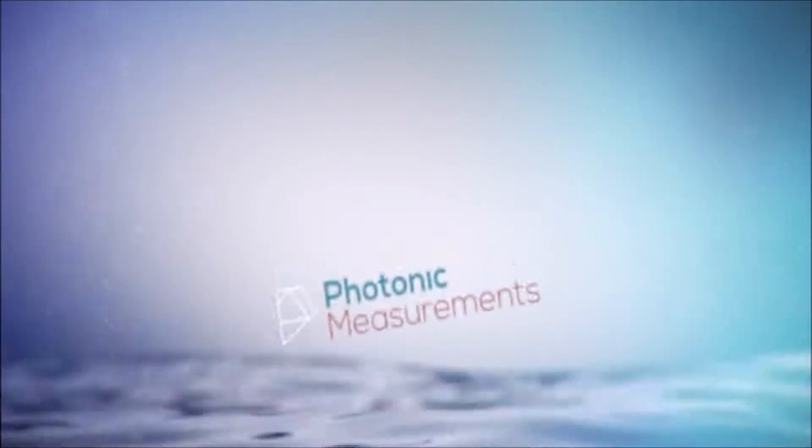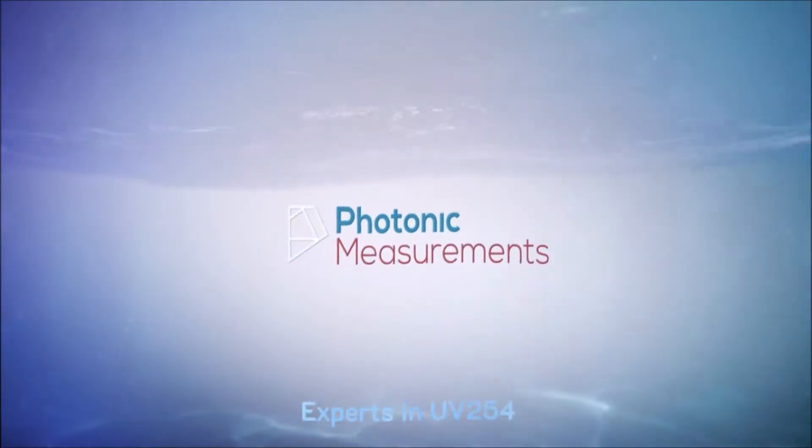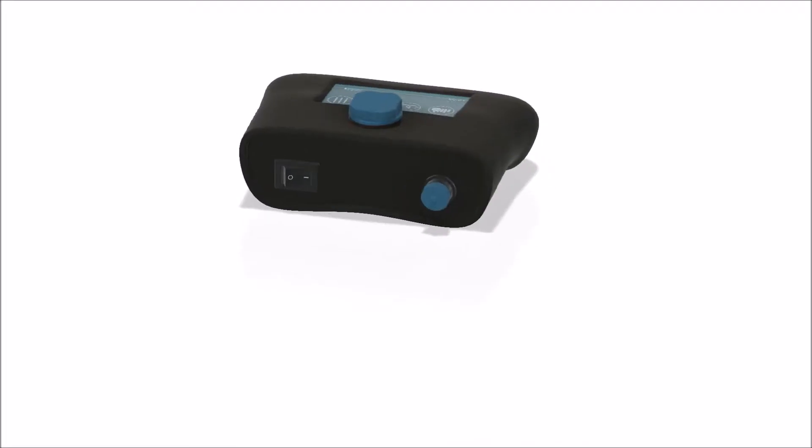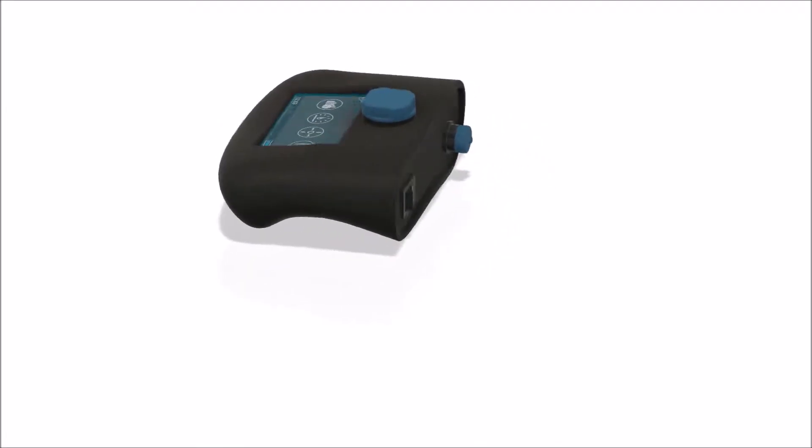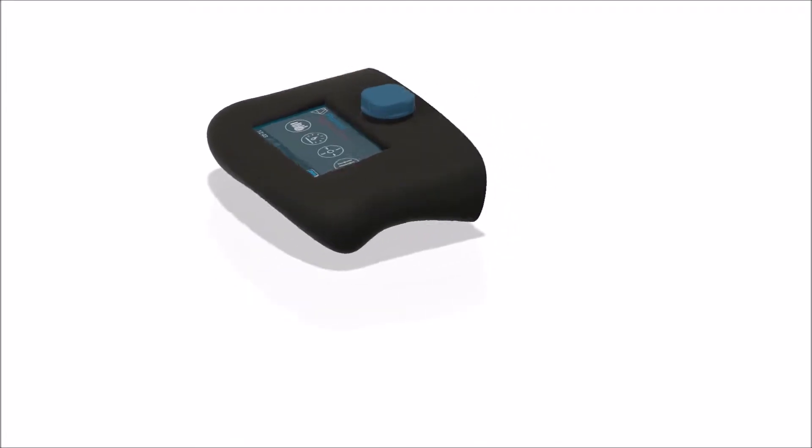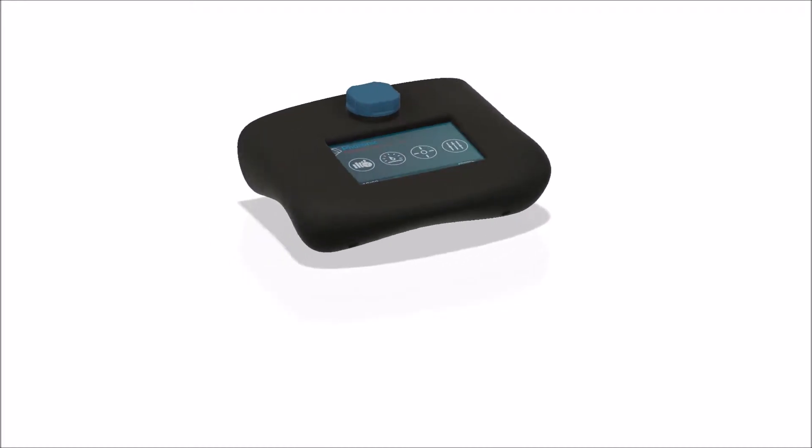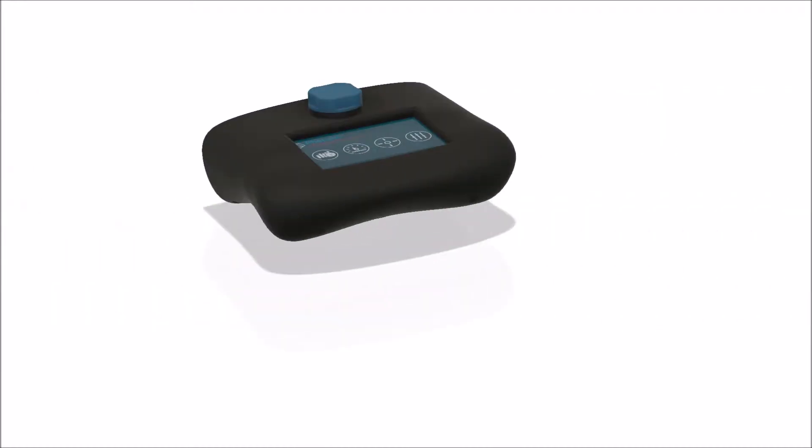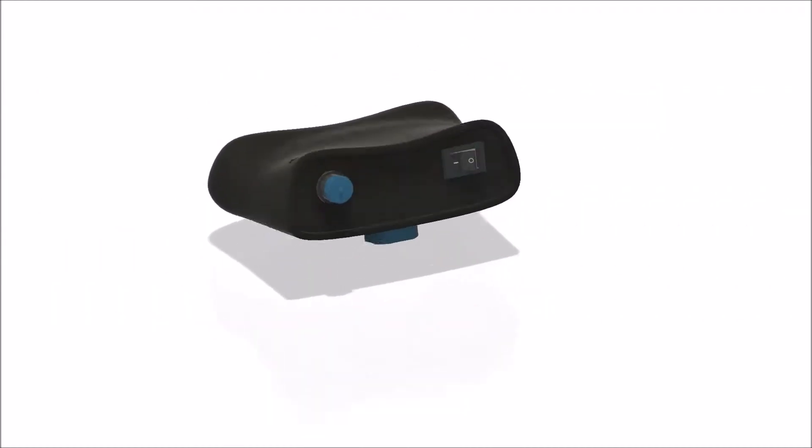Photonic measurements, experts in UV254. The UV254 GO is a lightweight portable analyzer which facilitates fast and easy measurement with accurate results obtained within seconds.